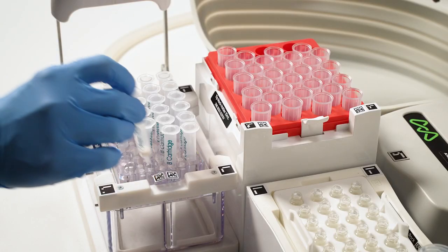With the Extraction Plus device being a companion to the Andrew Plus robot, there are a few things to take into consideration. First, this completely automated setup enables working with less samples than the maximum number of available positions in a rack or wells in a plate.